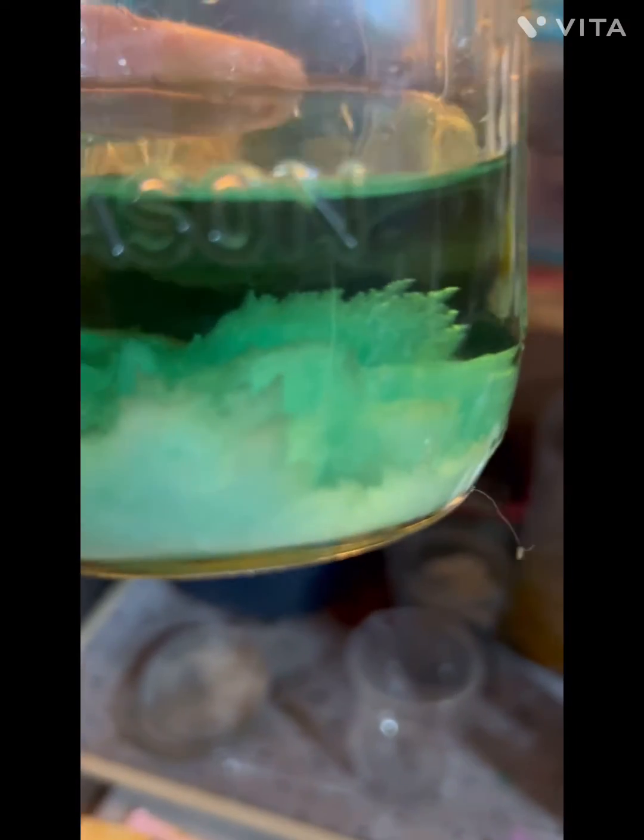That looks pretty good, don't you think? It's got a decent amount of weight to it — or maybe I'm just weak tonight. But man, I'm pretty stoked. Third try definitely worked out. That is ferrous sulfate crystals, ladies and gentlemen.